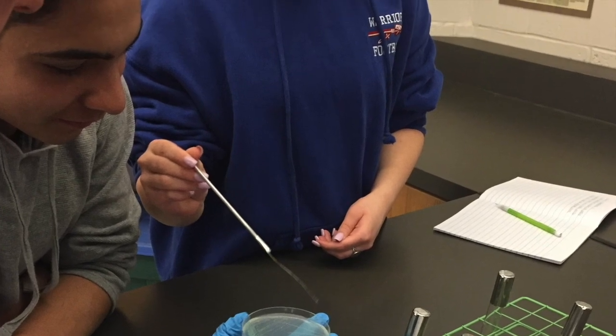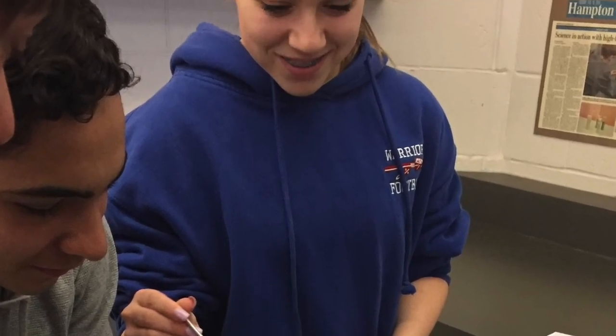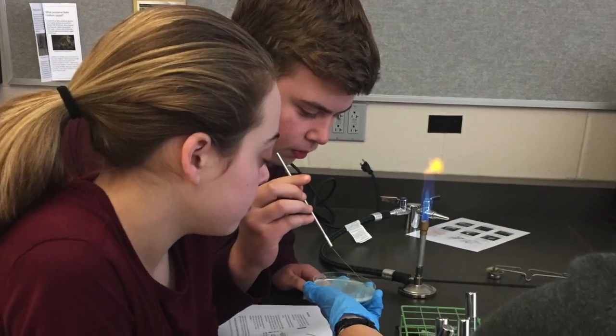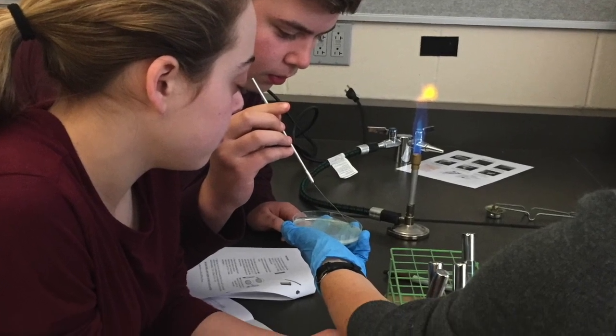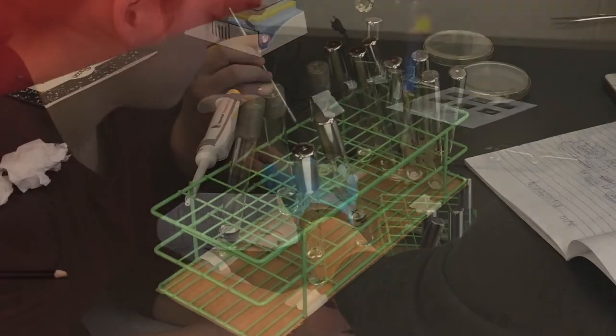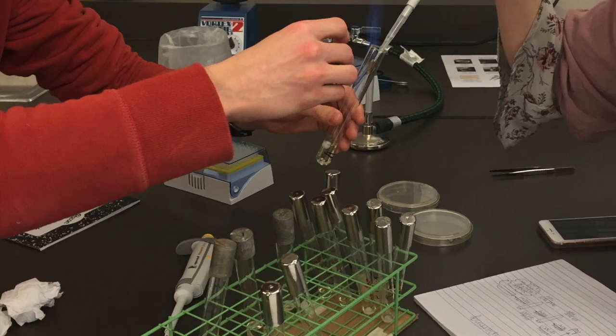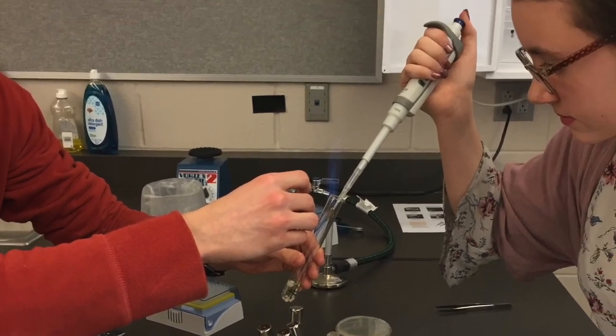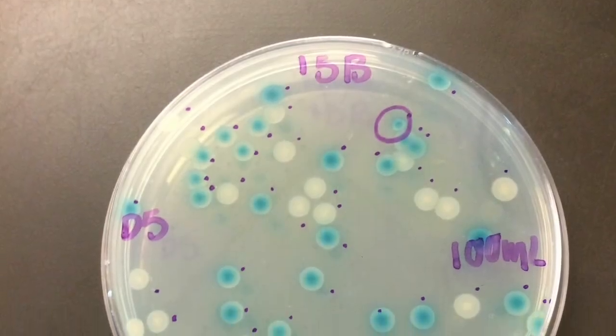Recalling your high school experiences, imagine that instead of watching a video or listening to a classroom lecture about these concepts, you joined a small group of your classmates around a Bunsen burner, a tube of media containing a small plastic bead, and a petri dish covered with fluorescent colonies of a harmless bacteria.